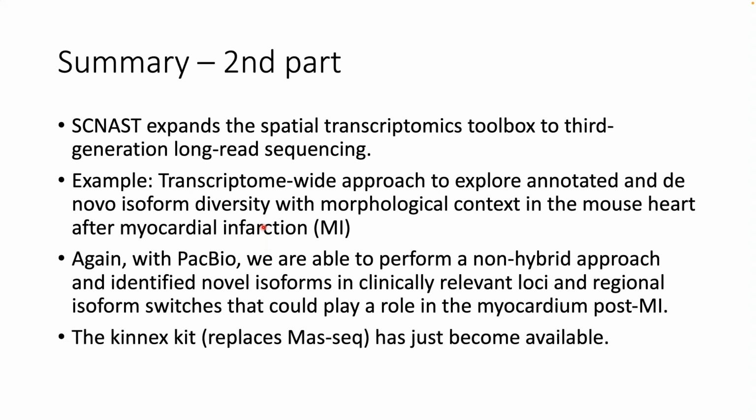So my last comment is essentially that the kit or the approach that I was presenting to you was all relying on MAS-Seq, and there's a new kit just recently coming out, which is called Kinnex, which of course provides you with even greater power. And so I can only encourage you to interrogate and ask your local sales representative about this one.